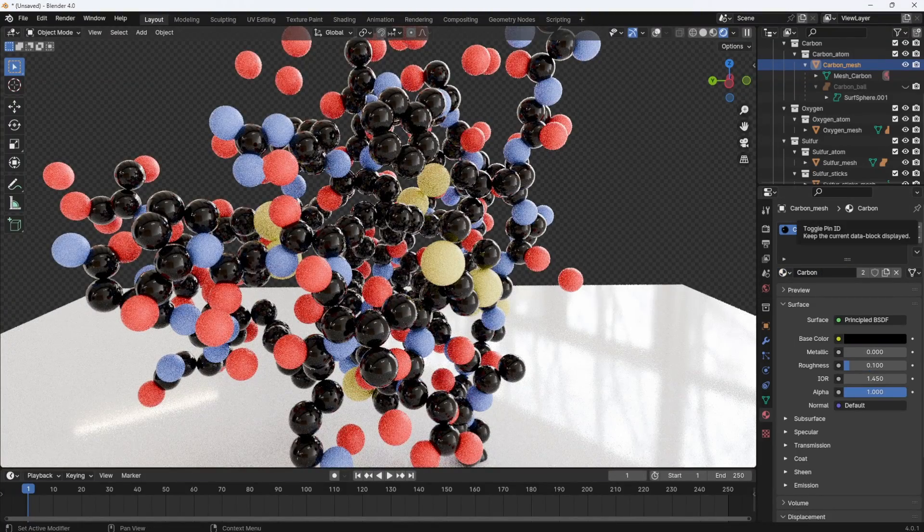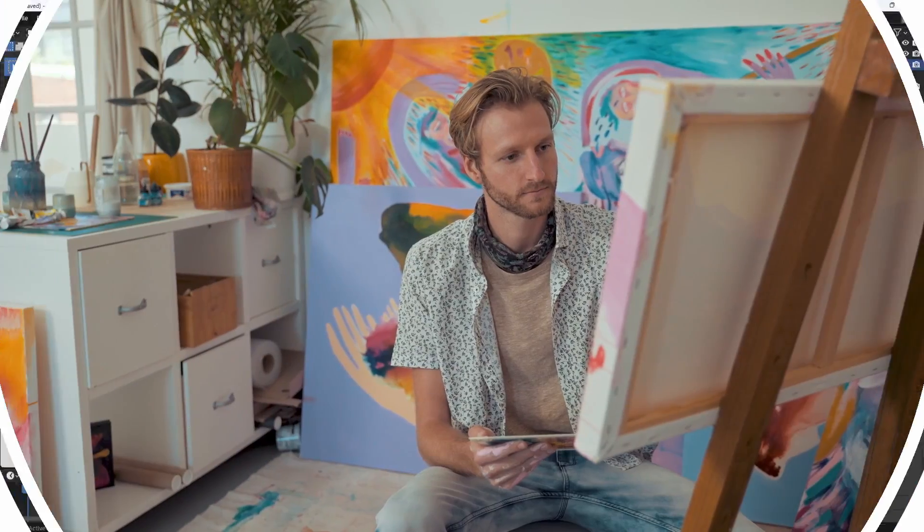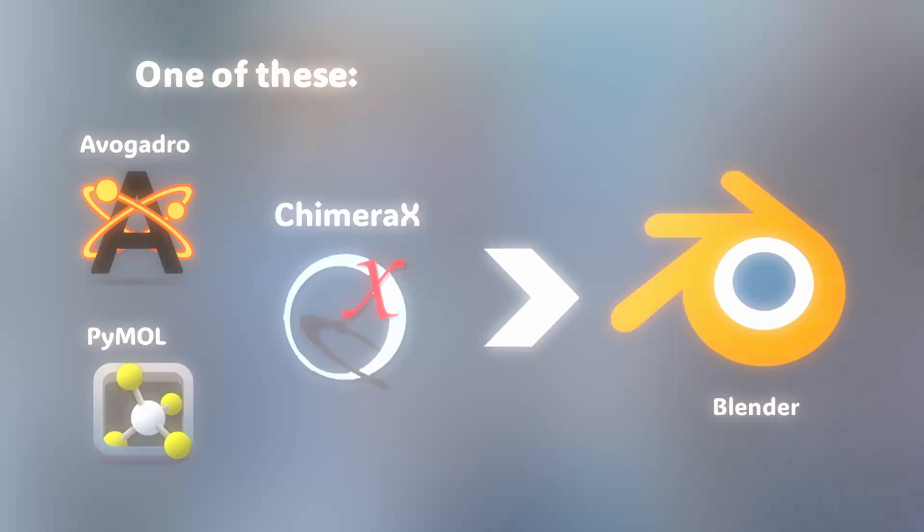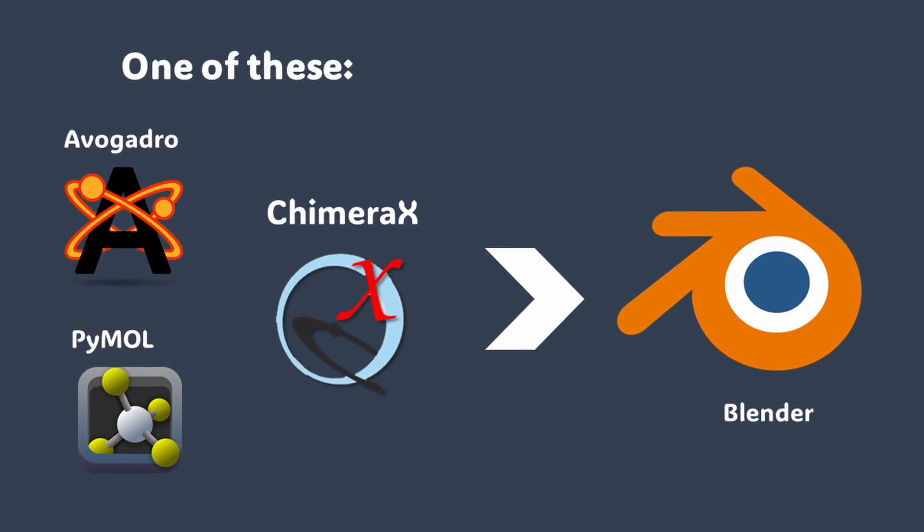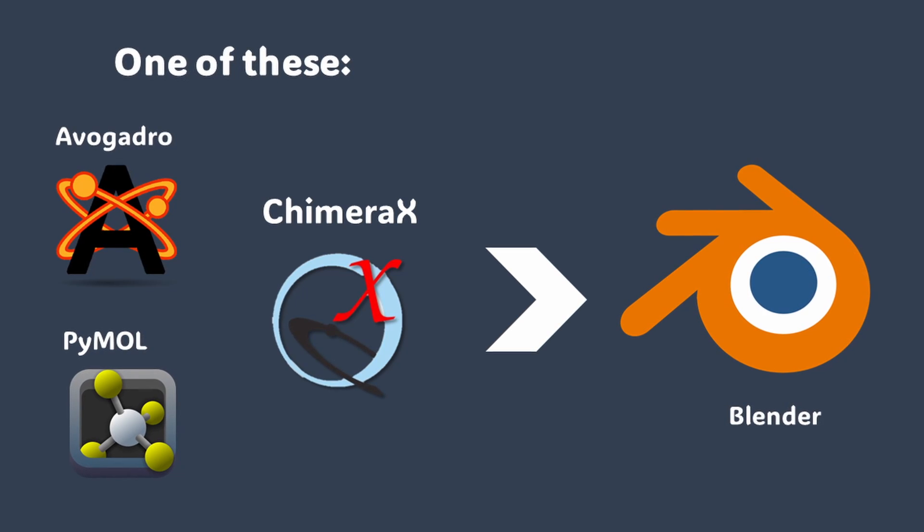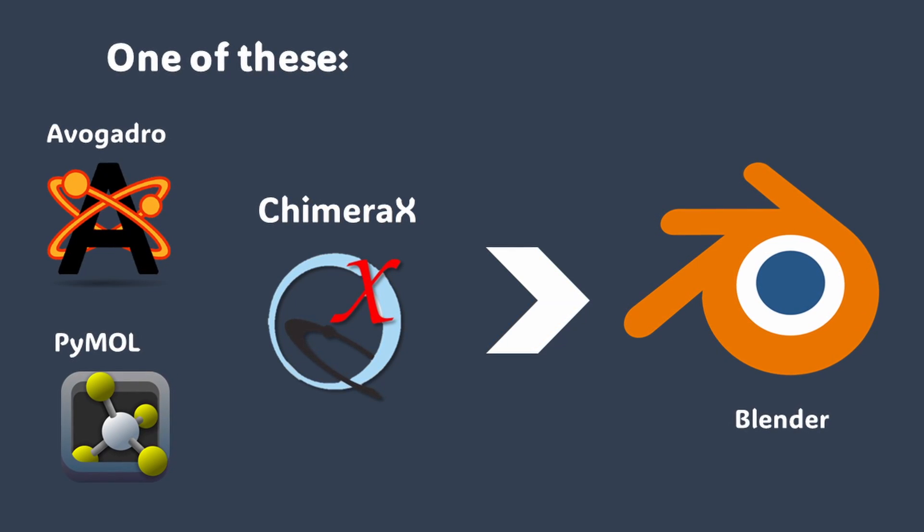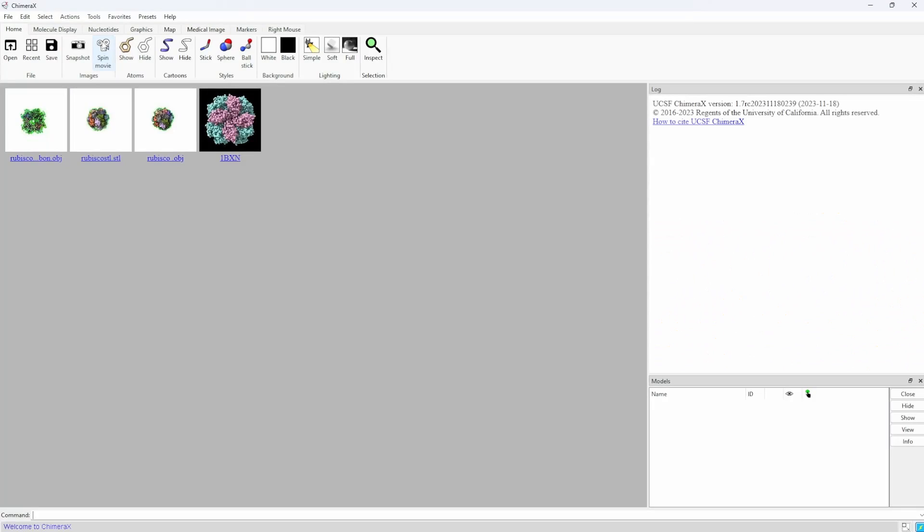Now, there is a way to do this that allows for a lot more artistic freedom, and that is using a third-party program to process your protein and put it into Blender. Today, I will showcase this process using ChimeraX.